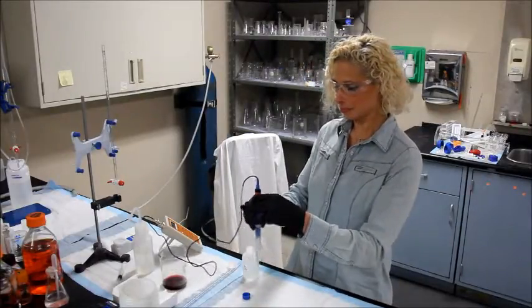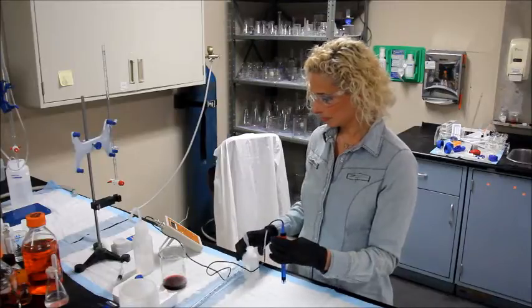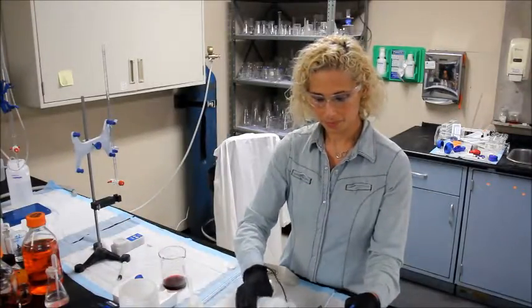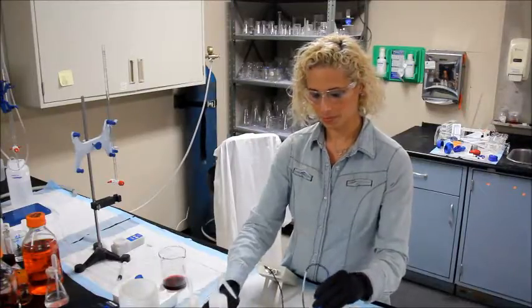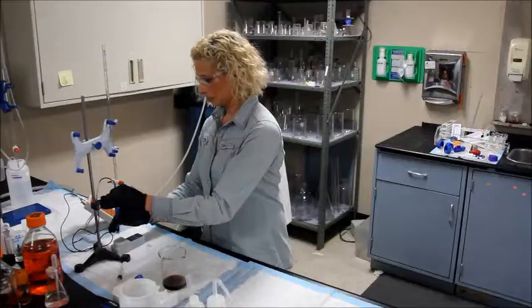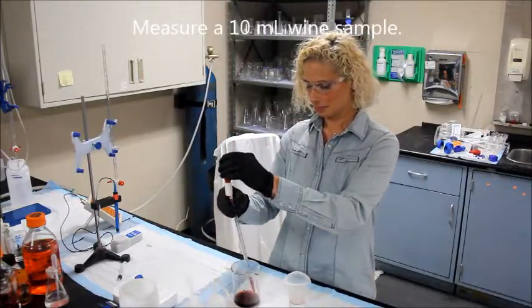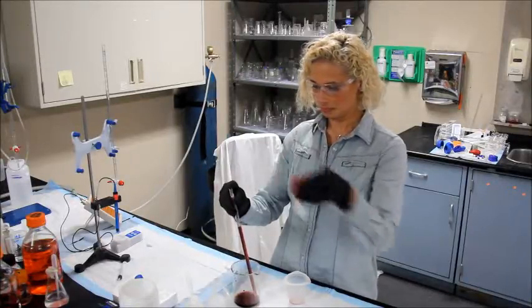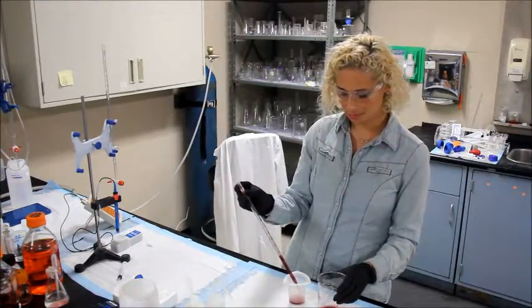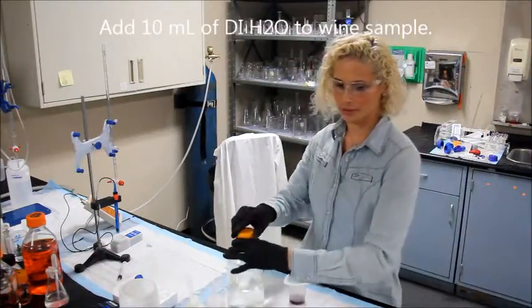I only added a couple of drops and I'm already there. Go ahead and cap this off, then rinse your pH probe. Set it up in your probe kit. Now take a 10 ml wine sample and place it in your beaker.